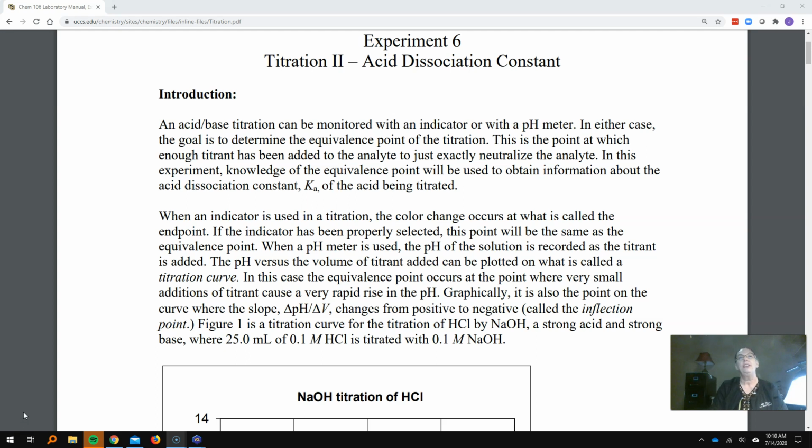We also have vinegar in there. Acid-base indicators can be weak acids as well. So we have two weak acids in there. We have the bromocresol green, which is the indicator. It changes color, and we're going to use that fact to help us. And then we also have the acetic acid, which is a weak acid. But the bromocresol green is going to be changing color first and helping us figure out the Ka just for the bromocresol green.